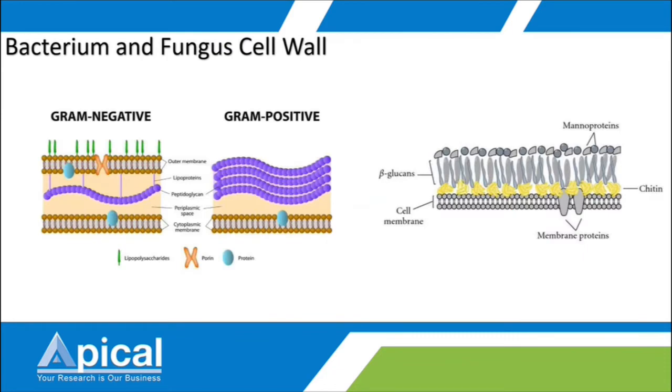Okay, so today we are going to talk about bacteria and fungus. So we need to understand a little bit about the membrane structure, the place where you want to break the cell, right?